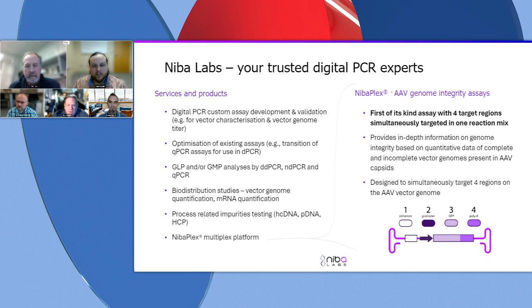Great, thanks. So David, just going back, so we see we have these multiplex assays up here. What are some of the considerations when you're trying to design a multiplex? What are some of the challenges of trying to put something like that together?